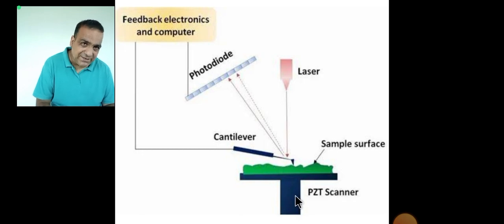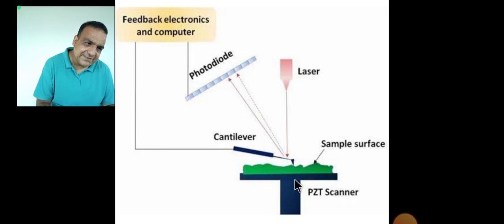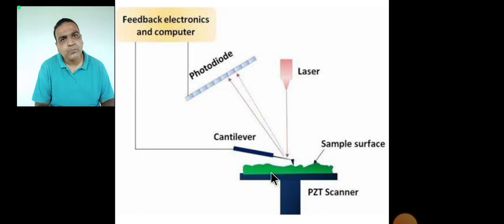The tip is raster scanned across the sample surface using piezoelectric scanners. As the tip scans, the deflection of the cantilever is continuously monitored and recorded.